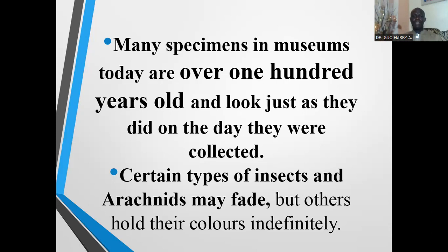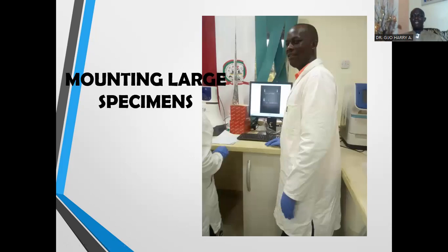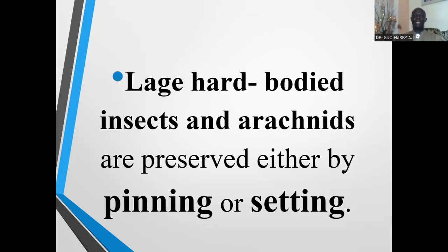Certain types of insects and arachnids may fade, but others hold their colors indefinitely. So the pinning technique and other preservation methods are usually very effective. Though the hard-bodied insects are now categorized into smaller insects and the larger insects. The large-bodied specimens are preserved through pinning and setting.